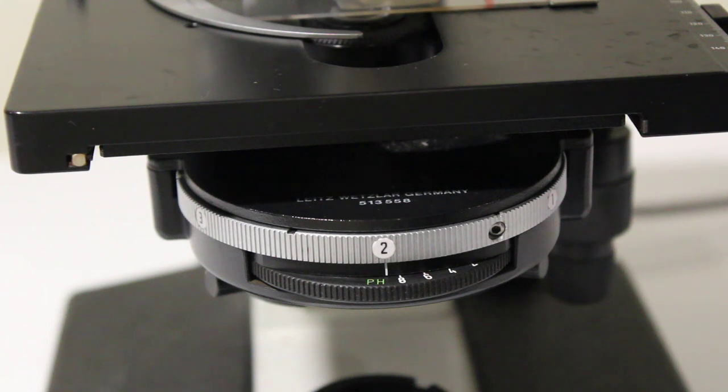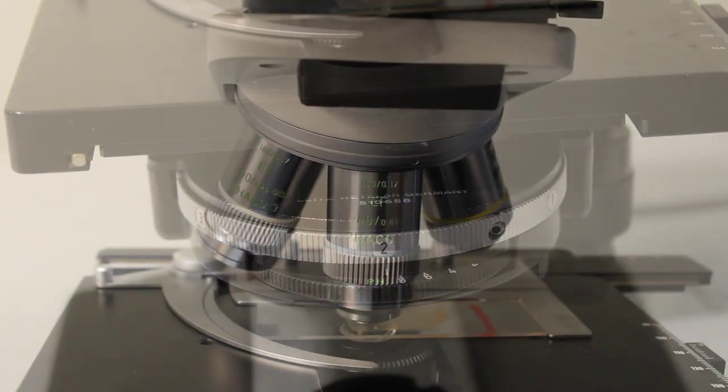So it does make it a lot easier to find cells and count cells. It's a little easier to analyze bacterial morphology than just with a straight wide field microscope but it's really not something you need in a brewery microscope.